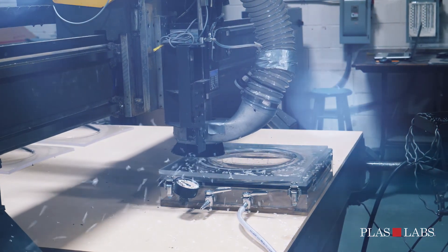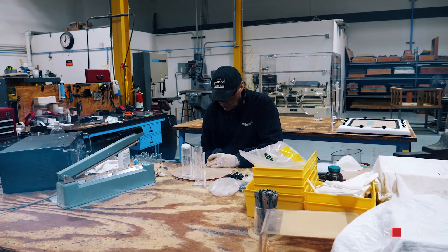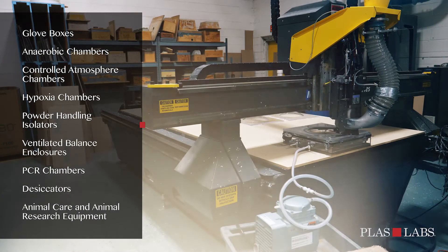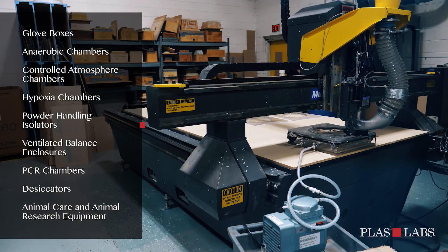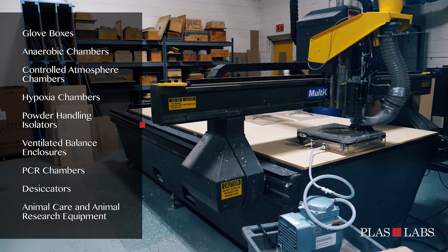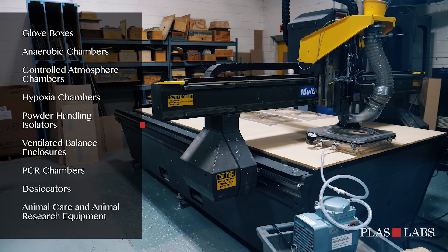We work closely with individual research scientists to design and manufacture custom, one-of-a-kind units for their specific research needs. PlasLabs research line includes glove boxes, anaerobic chambers, controlled atmosphere chambers, hypoxia chambers, powder handling isolators, ventilated balance enclosures, PCR chambers, desiccators, and animal care and animal research equipment.